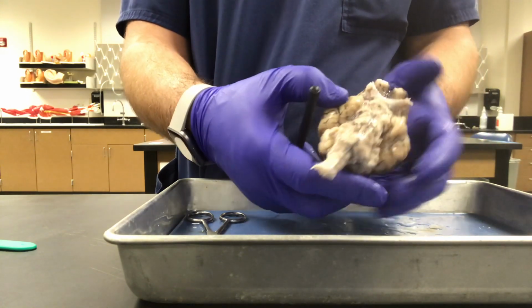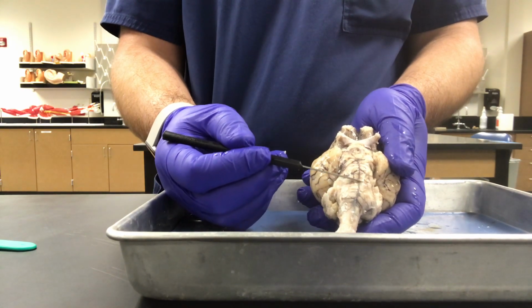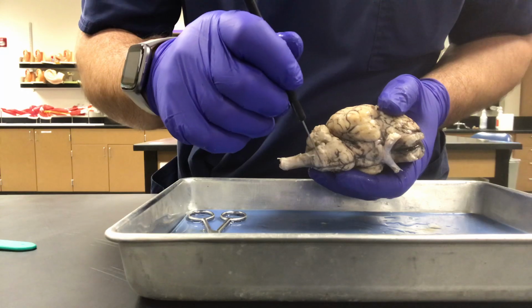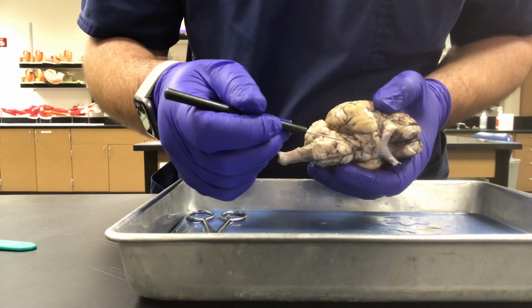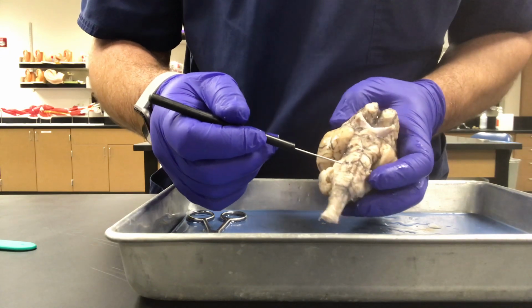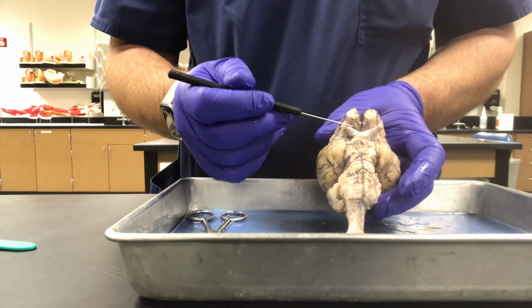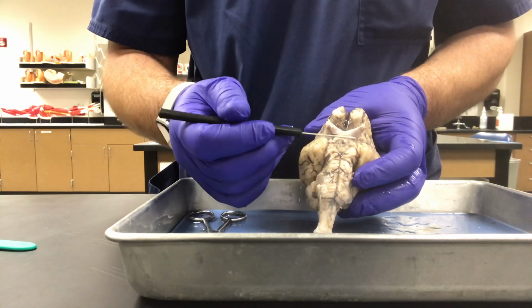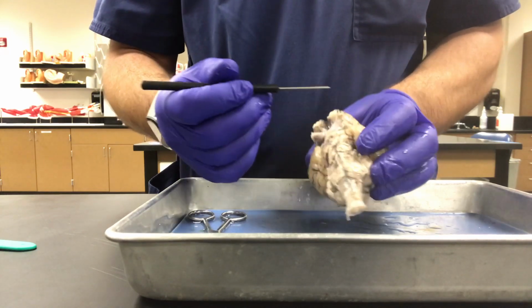If we go to the bottom of the brain, we have an area right here, I'll show you from a different view. This area right here is known as the pons. That is the pons. Next thing I want you to identify, we have two little things sticking up right here, 1 and 2. They help form an X down here. That's going to be called the optic chiasm.